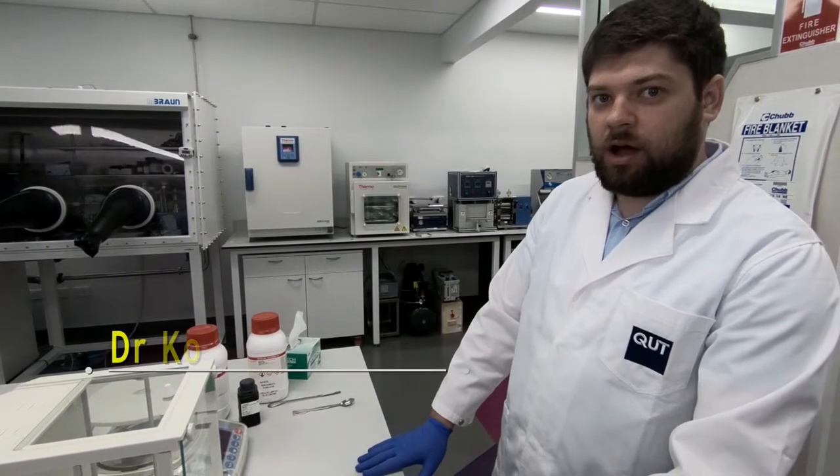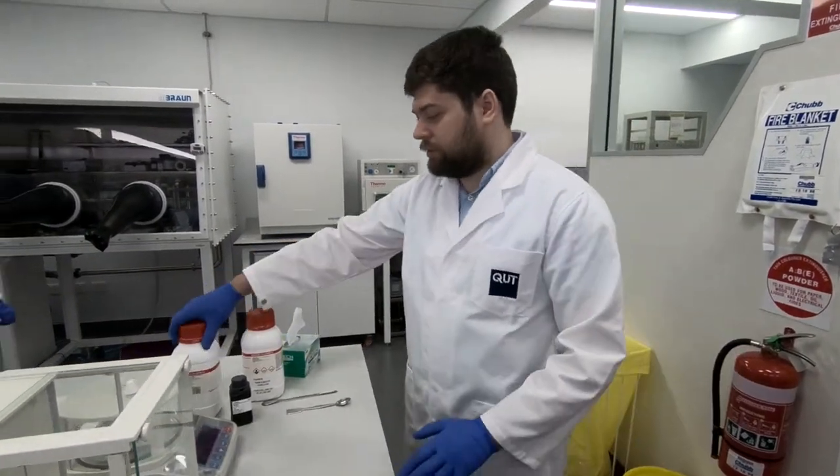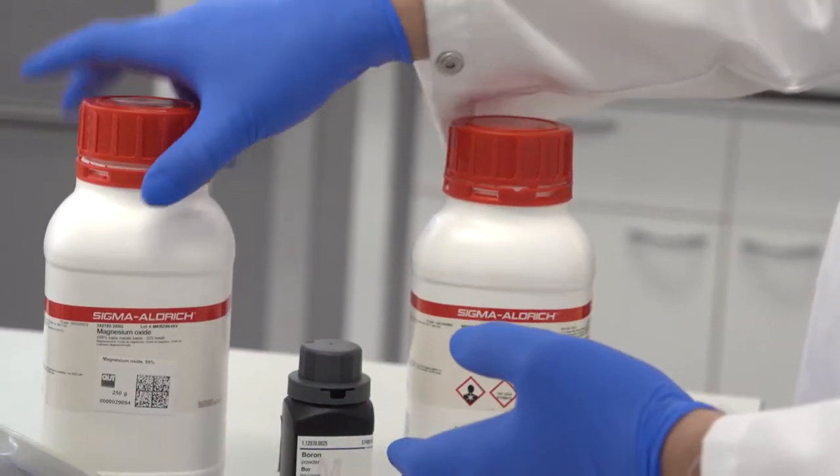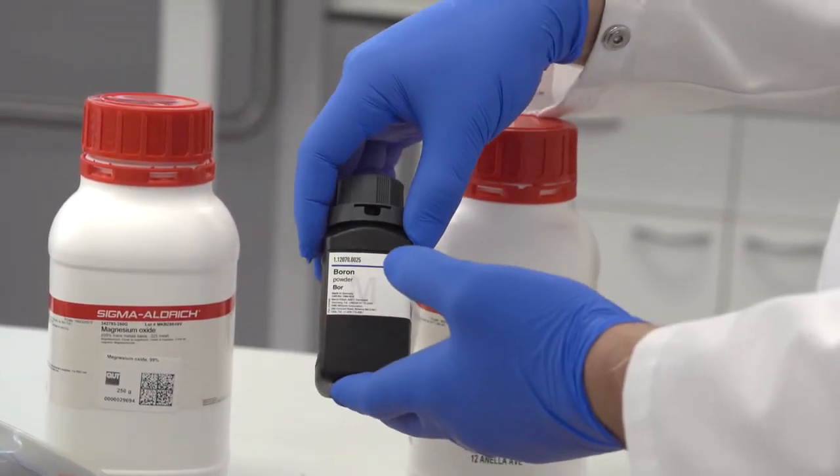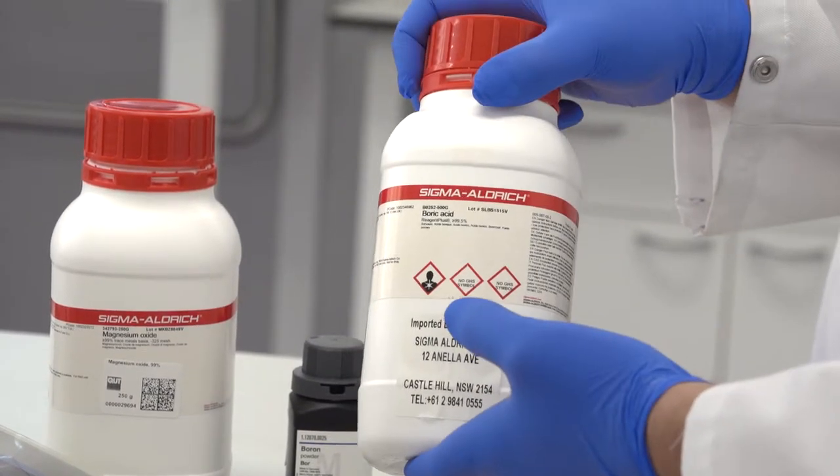Hello everyone. Our first step is preparation of powder mixture. For this synthesis we will use 0.5 grams of magnesium oxide, 9 grams of boron, and 2 grams of boric acid. First of all, we need to measure the weight of powders.